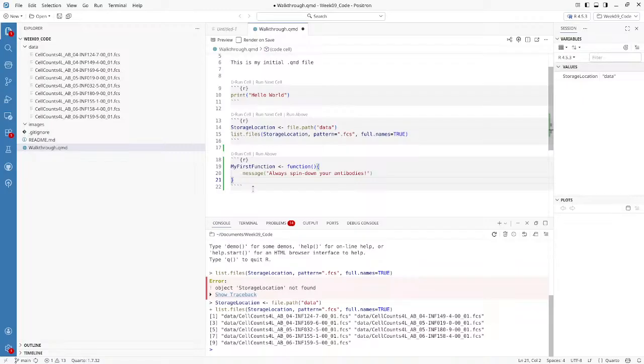Typos are still important for the learning process. It's how you learn how to troubleshoot your code, but this is one easier way rather than having to write things out continuously, especially for some of those more complicated code blocks. Obviously, you could also go back to the original file in the index.qmd, but this is just some things that have been a little bit easier for those attending in person.